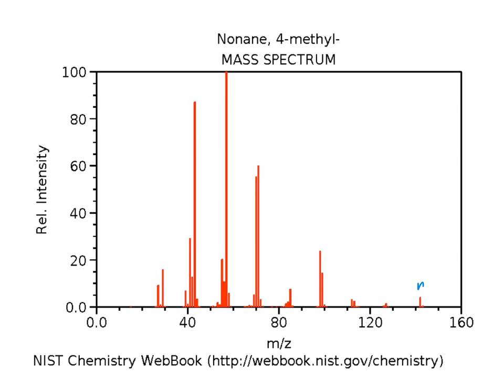It still has the same molecular ion, but when I was looking at this again today, the base peak didn't seem like the one that would be the easiest to form, because we'd expect it to cleave around the branch point.